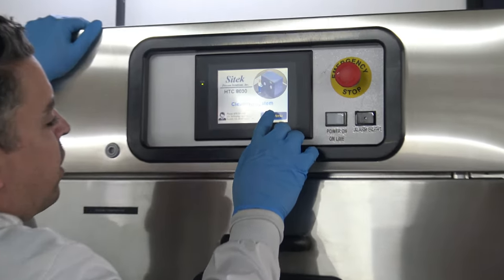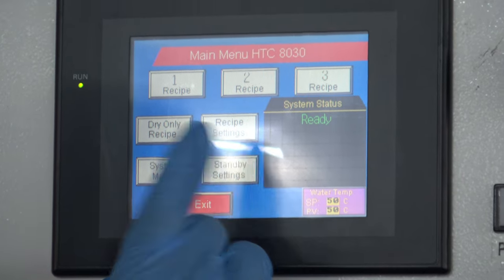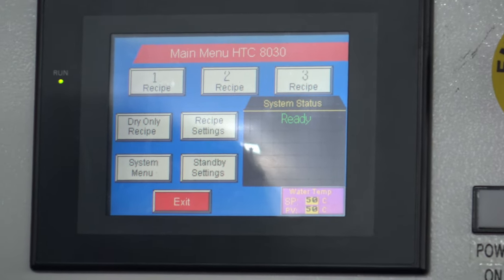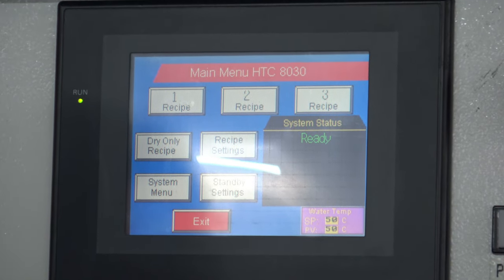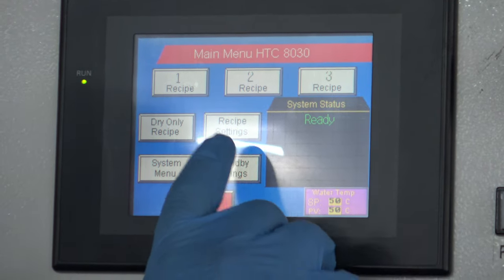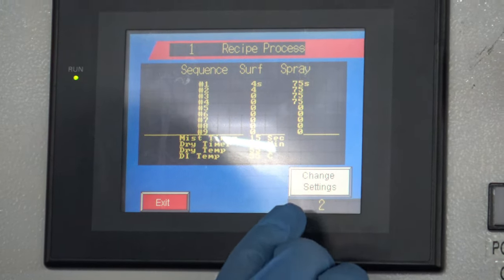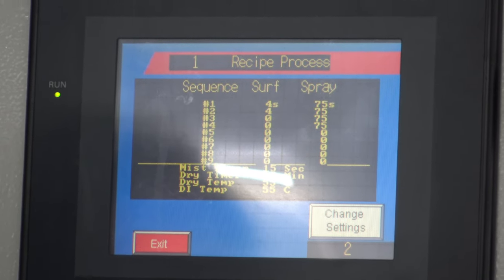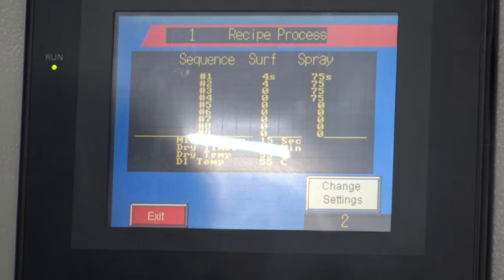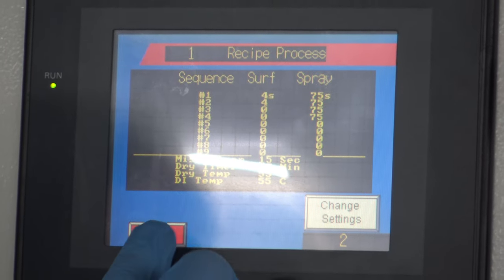Now we're going to come into the software. Tap the main menu to enter it. In here you have multiple recipes — recipe one, two, or three. Most customers only run one recipe, as this is essentially a semiconductor-grade industrial dishwasher. It also offers a dry-only recipe. You can go into recipe settings and program them — you can decide which recipe you want and change any settings. We already have it programmed at 55 degrees Celsius with 75-second washes and a 50-minute dry.